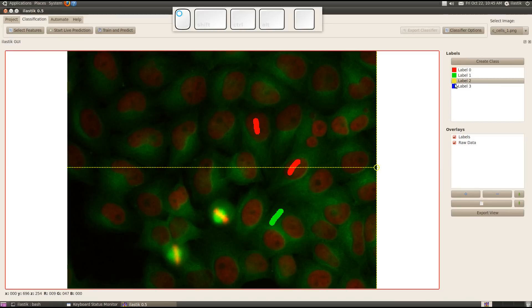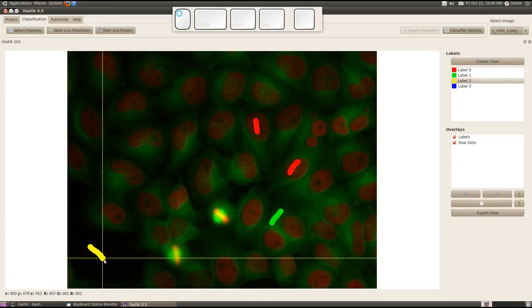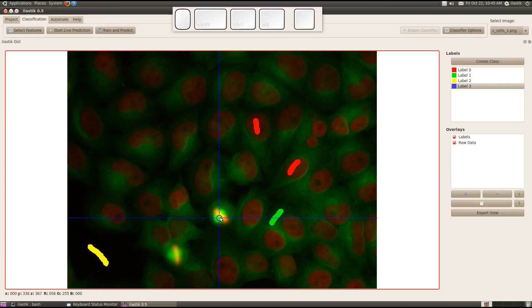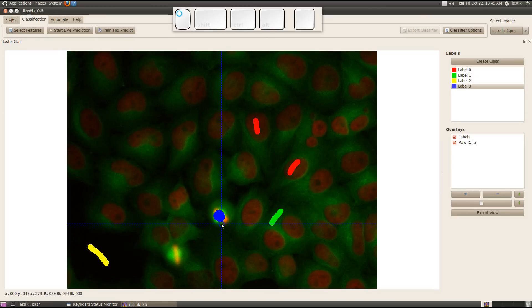I use the yellow class for background, and by using the blue label I indicate our special phenotype over here.